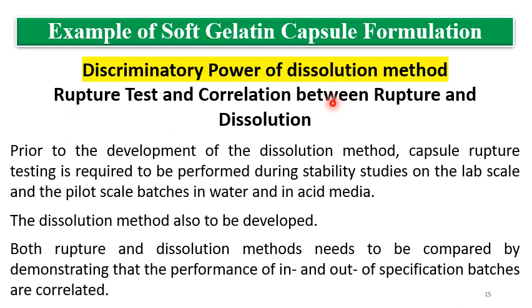Now the rupture test and the correlation between the rupture time and dissolution is required to be developed. See here, for the soft gelatin capsules, rupture time is very important for the drug release. Prior to the development of the dissolution method, capsule rupture testing is required to be performed during the stability studies on the lab scale and also on the pilot scale batches.